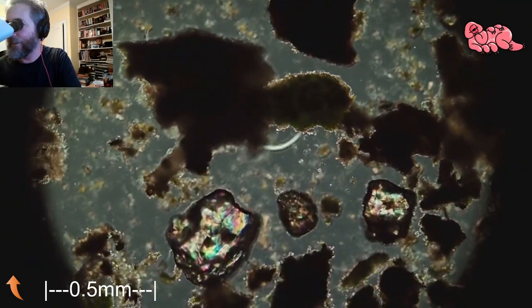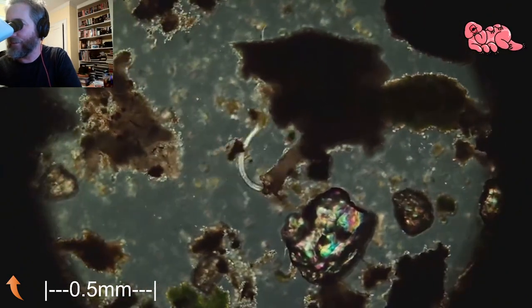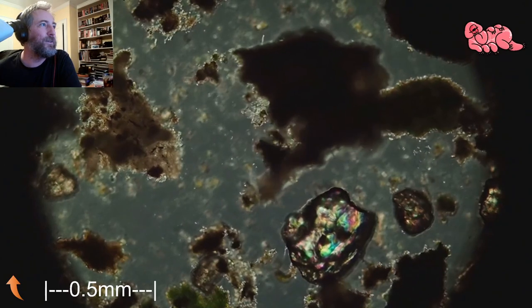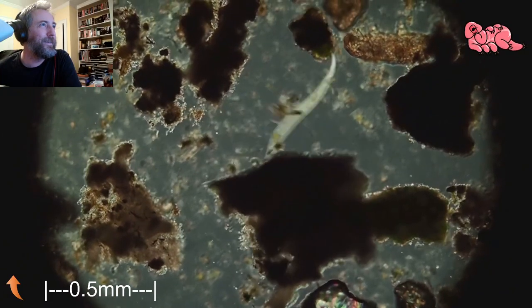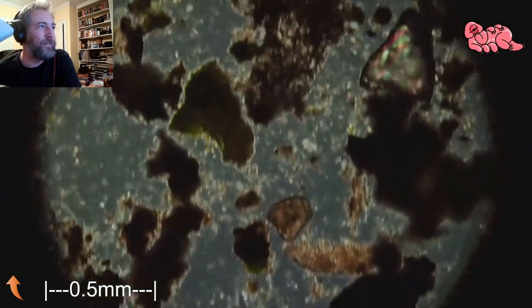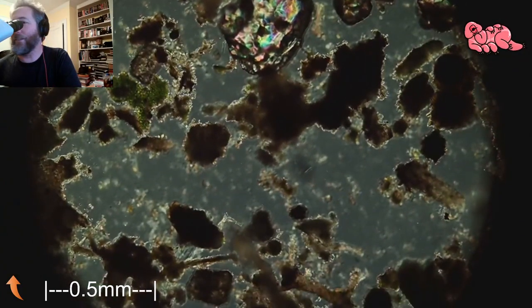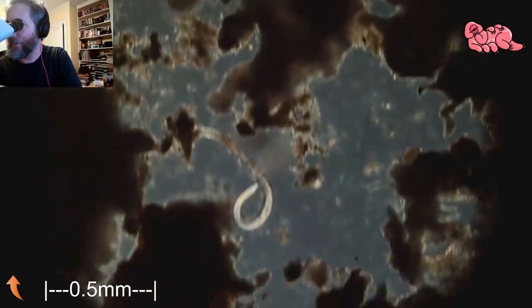And let's let this lady go on with her business and look at some of these other things that are in here. We can always come back to this one as well. It's not actually that far from the other one. There's a nematode. This is their normal pattern. They're spazzy. Oh, there's another water bear right there. I told you they were kind of rare, but we have that one. Is that the same one? Maybe that's the same one. Maybe up was down and I just got the same one back on there.